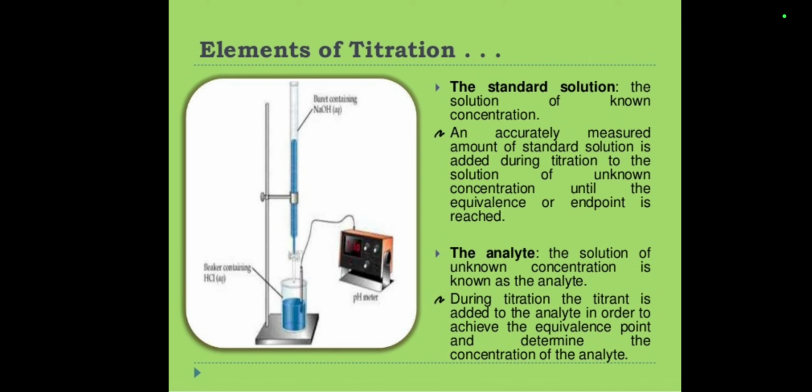So let's proceed. As I said a while ago, titration is not focused on the calculation, but rather on the steps, on the procedure, on how to demonstrate the experimentation, which is called titration. If we are focusing on the demonstration or the experimentation, there are elements involved. So, the elements of titration: there are two elements of titration.